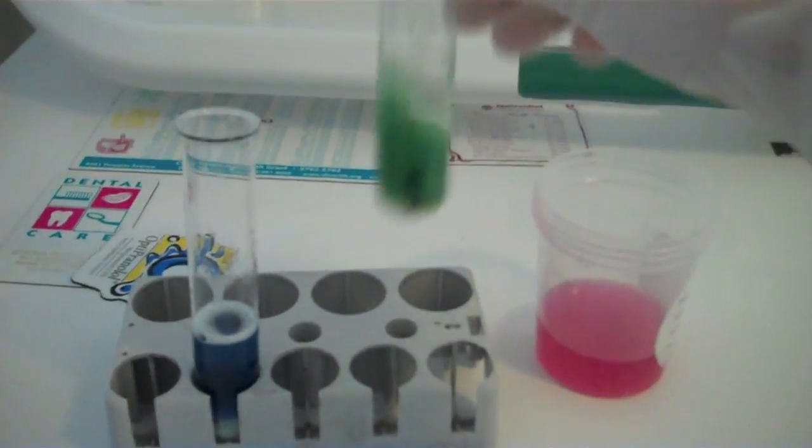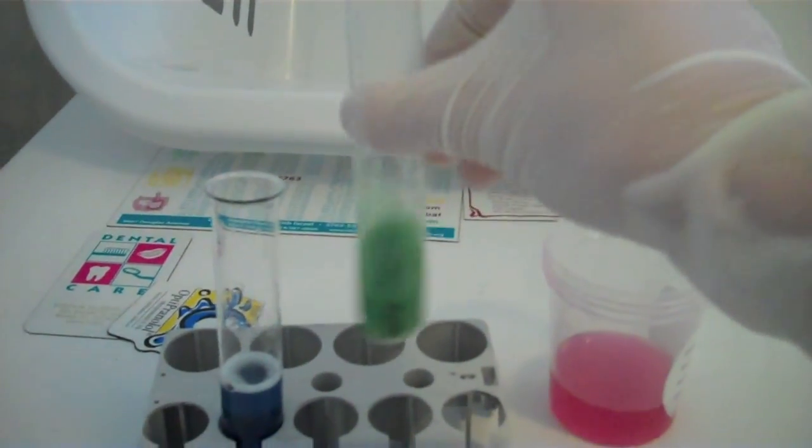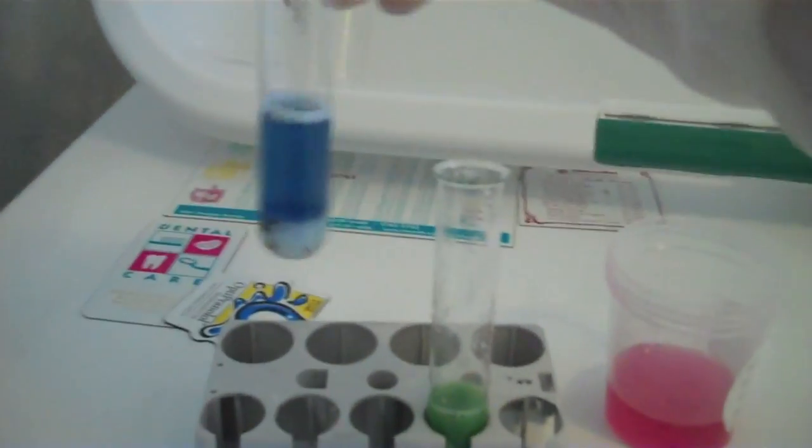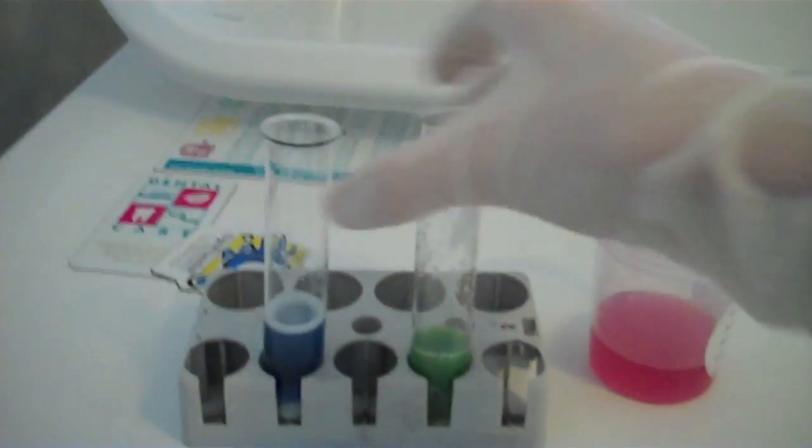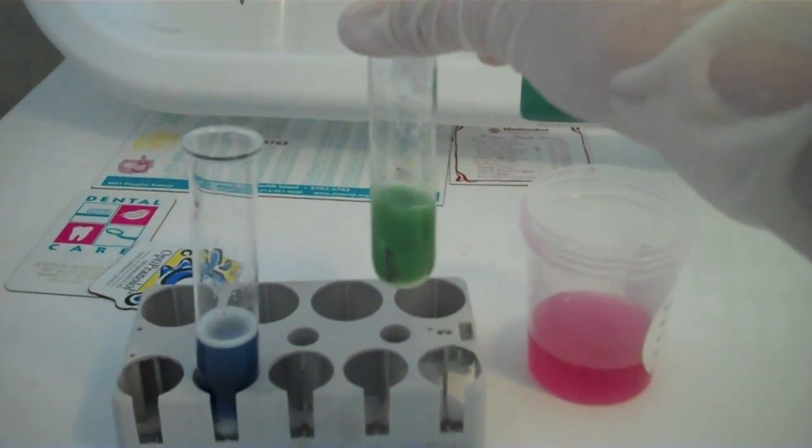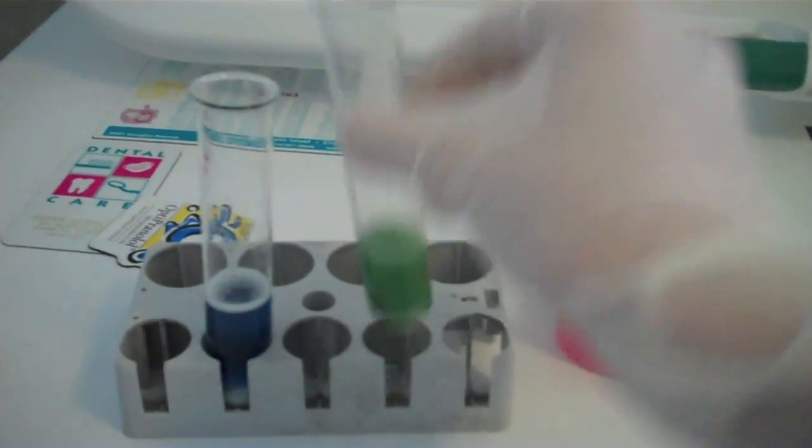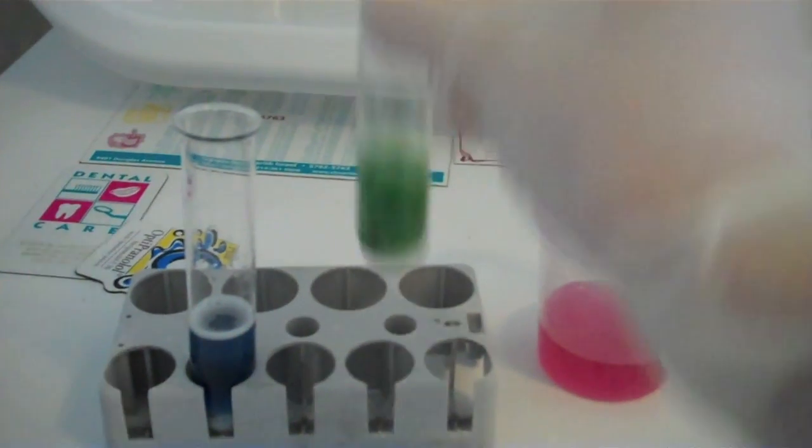As you can see, when I added the pH indicator made out of red cabbage to some sodium carbonate which I made in this video, it became green while the sodium hydrogen carbonate became blue. This is because sodium hydrogen carbonate is a weaker base. This indicates that we have made some sodium carbonate.